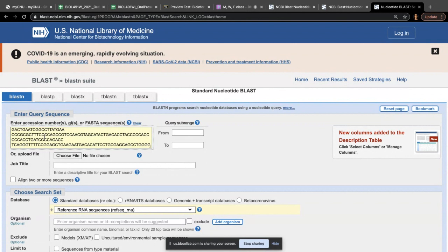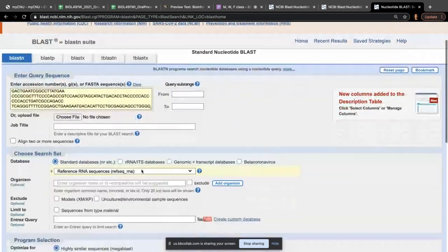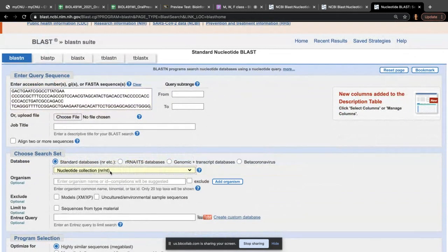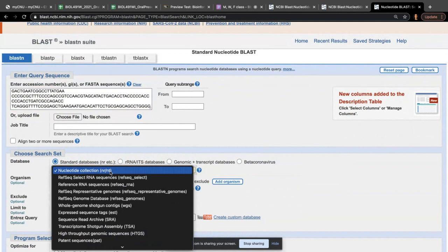So in my first BLAST that I ran, I just wanted to see if there's any sequence that matches that, and if I'm lucky, it will tell me a sequence that maybe tells me the function, if it has a function. Or maybe I have lots of results that don't say anything about transcription of that. So in my second window I narrowed down, I wanted to look at only RNA.